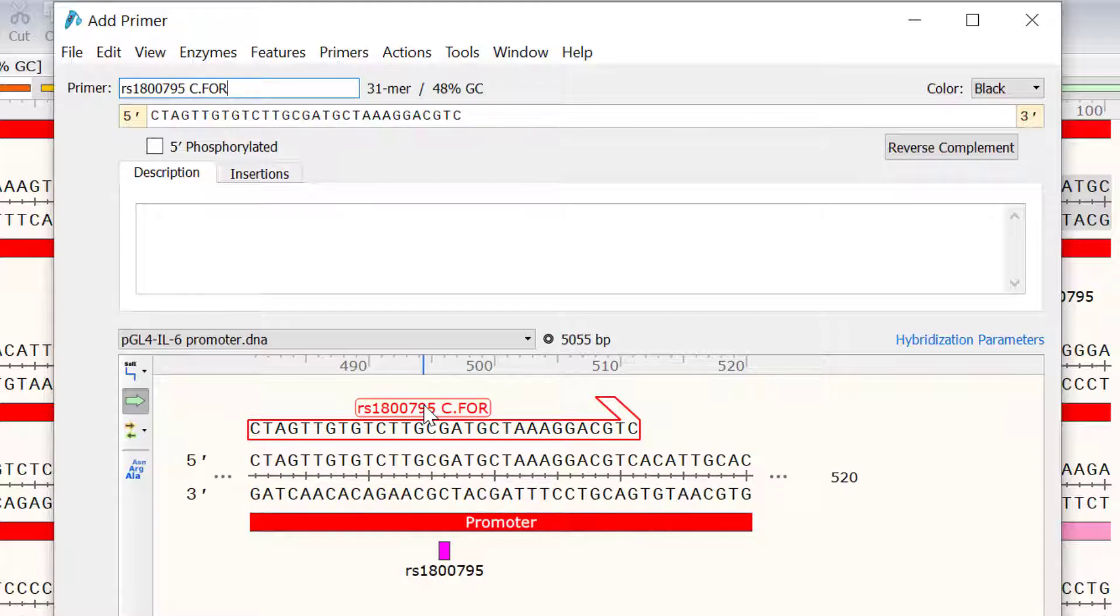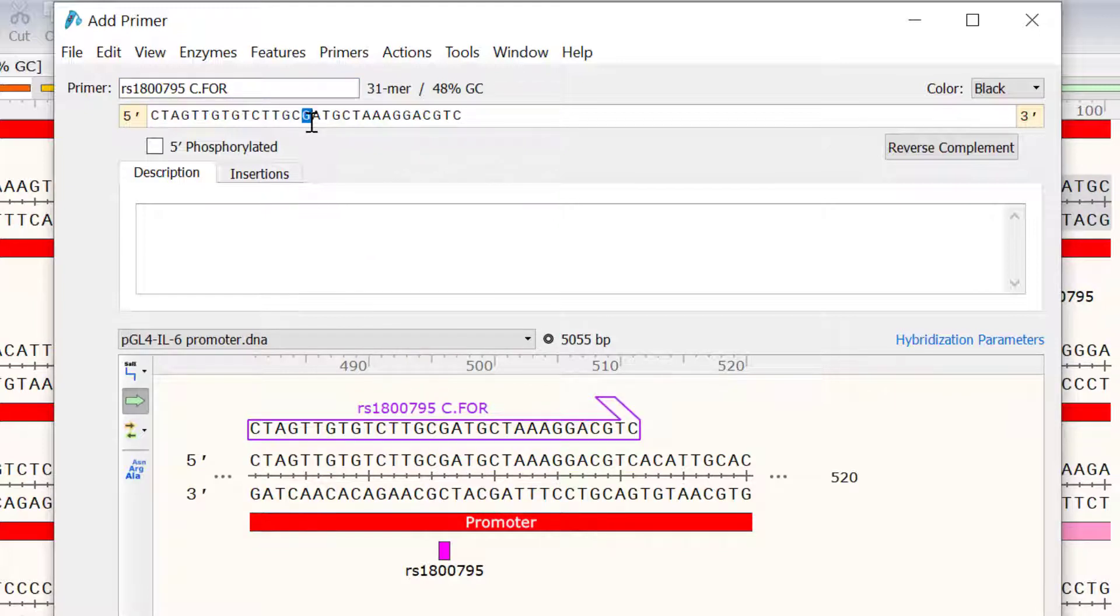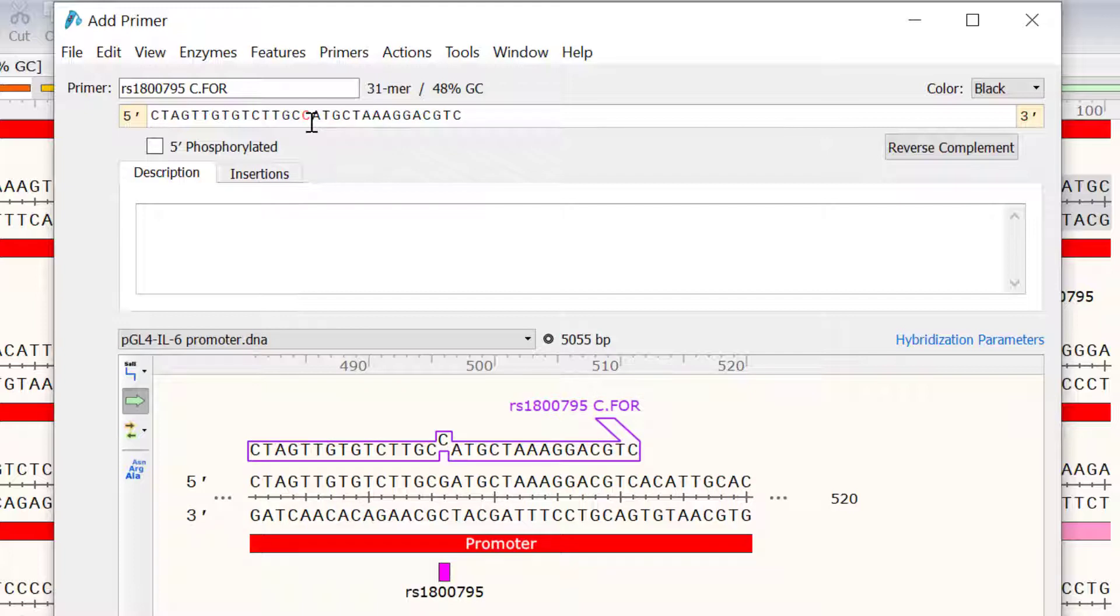I now need to change the G allele in the middle of the primer to a C allele. So, I will select this and press C. Notice how the new base is identified by a loop.